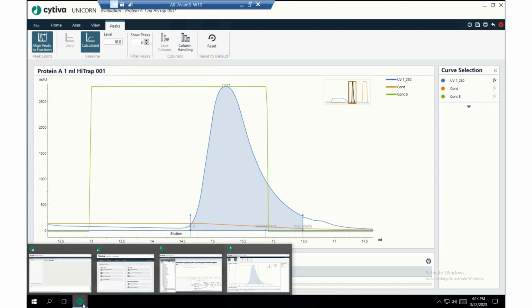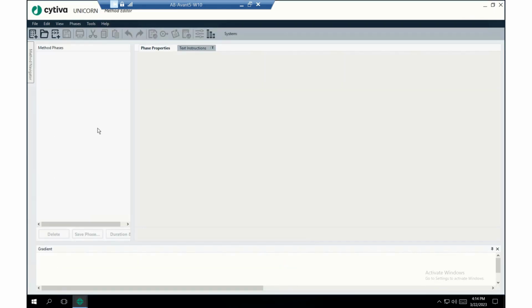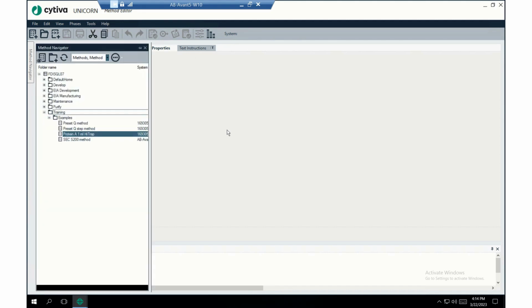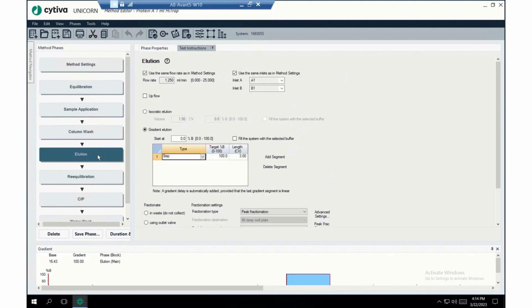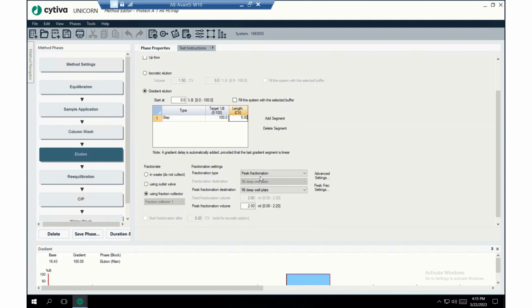So let's go to the method editor and open the method. So here's the method editor. And I went over how to find the method editor in another video. Here's the protein A method we wrote using the phase library. Okay, so hopefully this looks familiar. We're going to use the phase properties tab, and we're just going to go over to the elution phase, right? So the 2 things we need to change are the length of the phase and the peak fractionation parameters. So first off, the length of the phase is going to be 5 CVs right there. And then the peak fractionation parameters, we're still using peak fractionation, still doing 2 mil peak fractionation fractions volume.